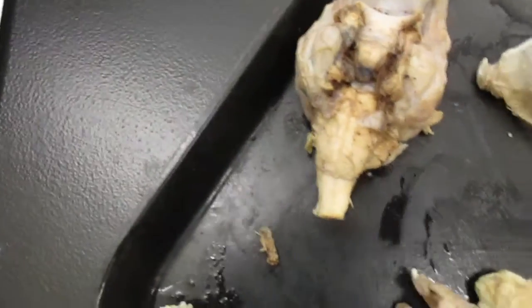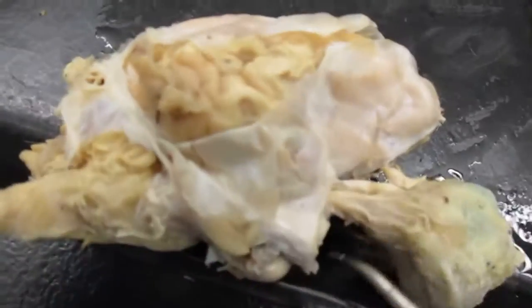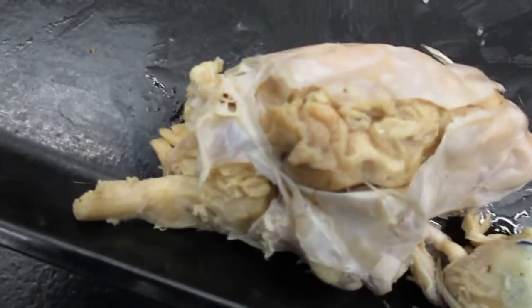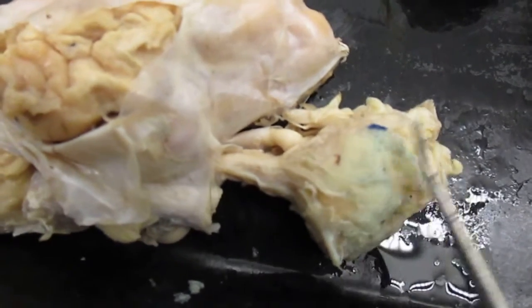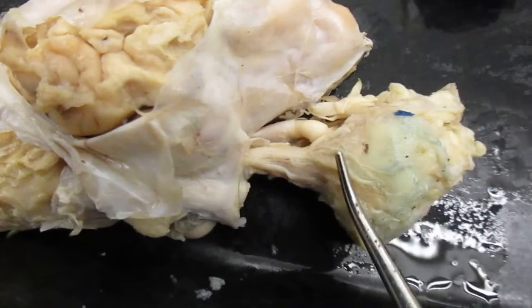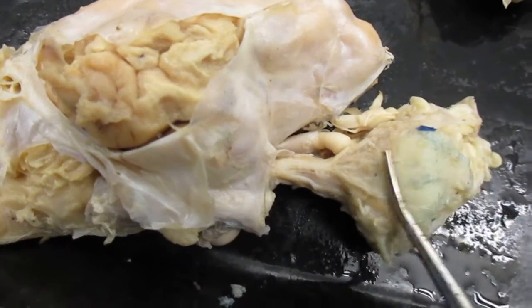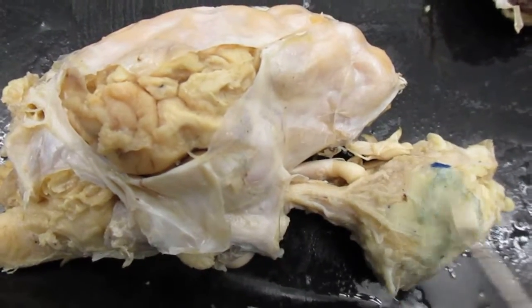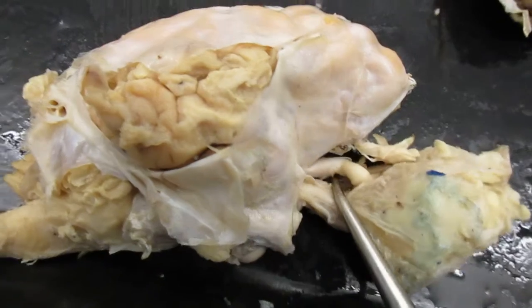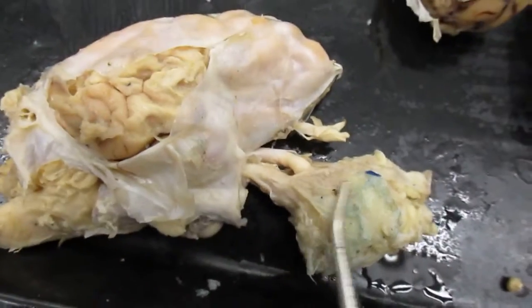So remember that the eye is going to be innervated by your optic nerve, right? Cranial nerve number 2, this right here. And there's a lot of fat that's going to be intertwined, mixed in with the extrinsic eye muscles. So this is a lot of fat that's going to protect the eye. So this is an optic nerve right here. And then here we have lots of fat.